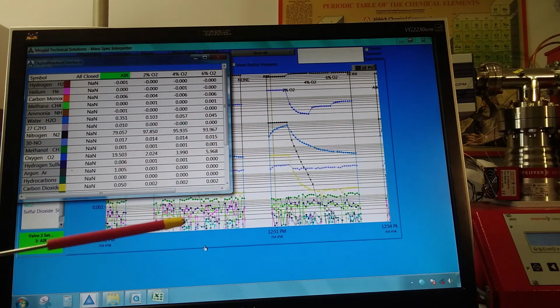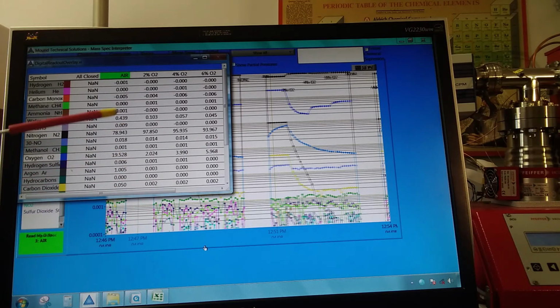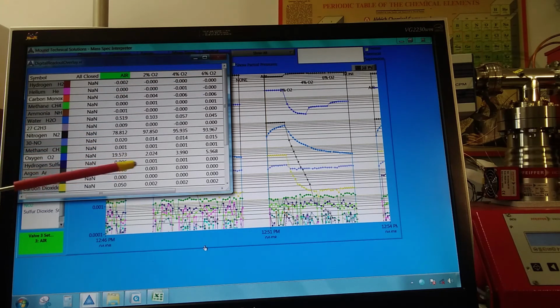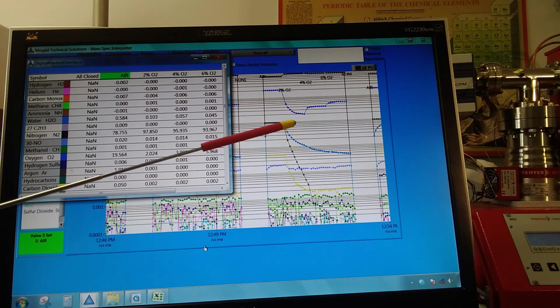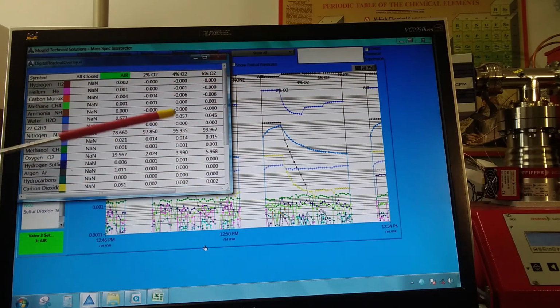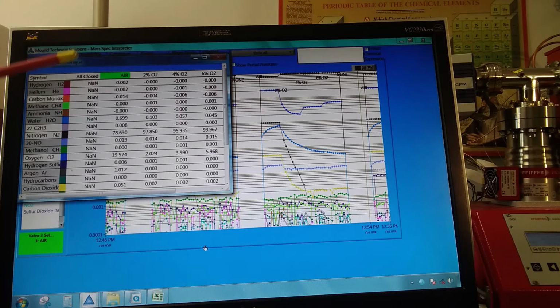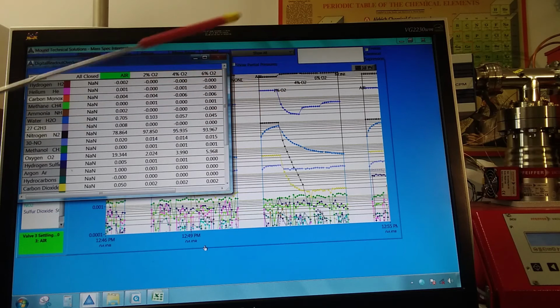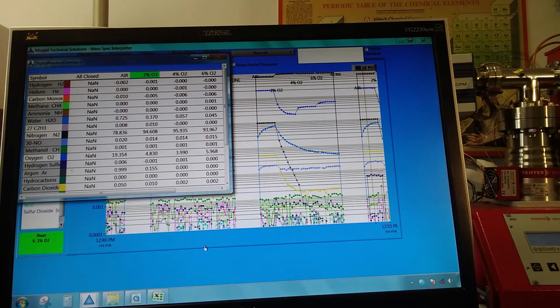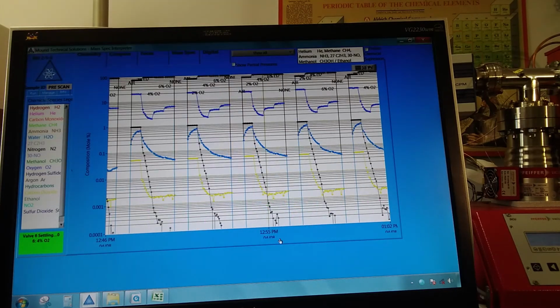We can observe the accuracy of the data, and now the one thing left to do is to observe how reproducible this is. So that's going to require us to leave it run for a little while, and we'll see if this data replicates itself time after time. Do we get the same accurate answers, or do we notice a drift over time? In all reality, for this test, we would run it for many hours to see what kind of results we would have. But for this demonstration, we'll just leave it go for just a little while.